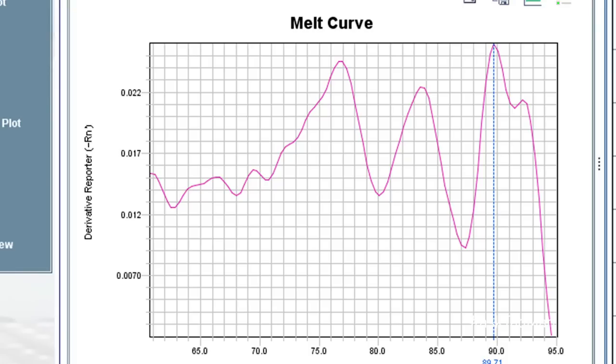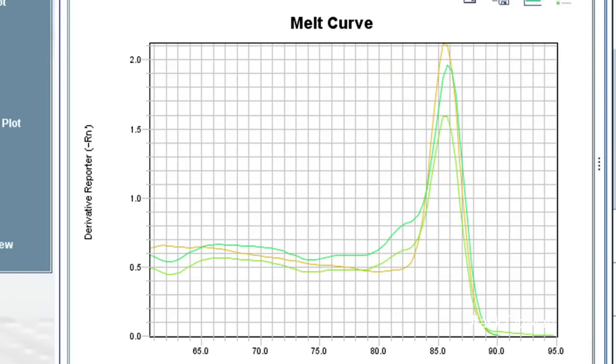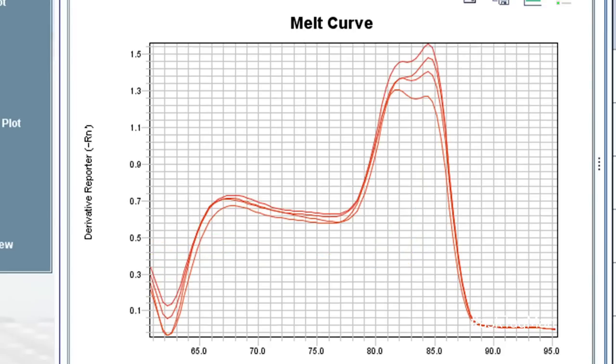But multiple discrete peaks are not the only thing that should concern you. Other anomalies such as asymmetrical peaks, shoulders, and unusually chunky peaks should make the user question the validity of his or her data.